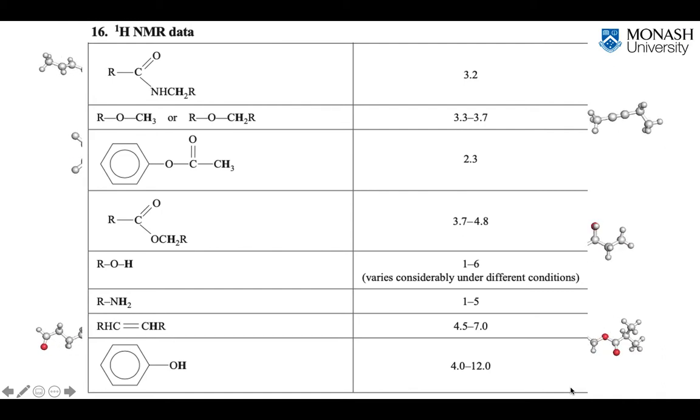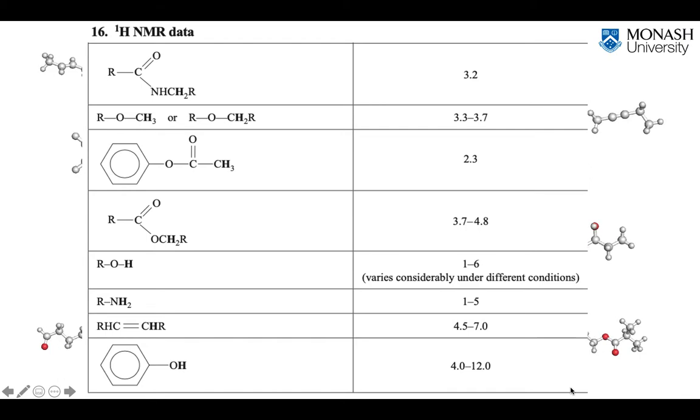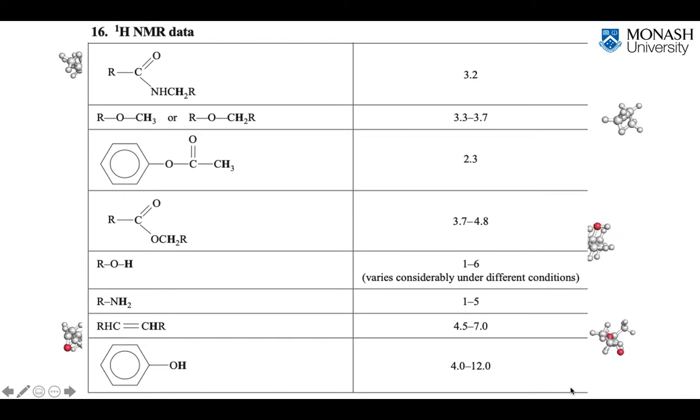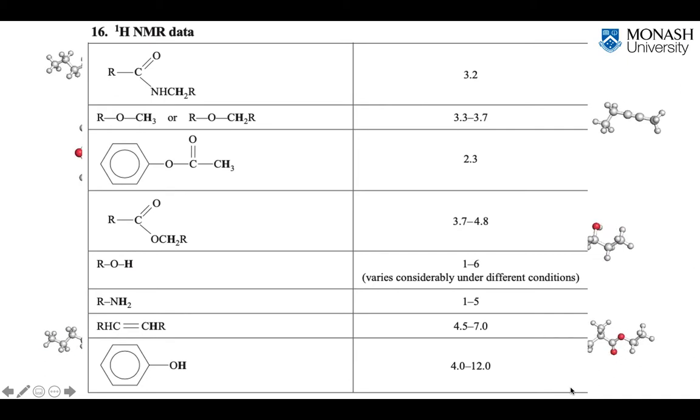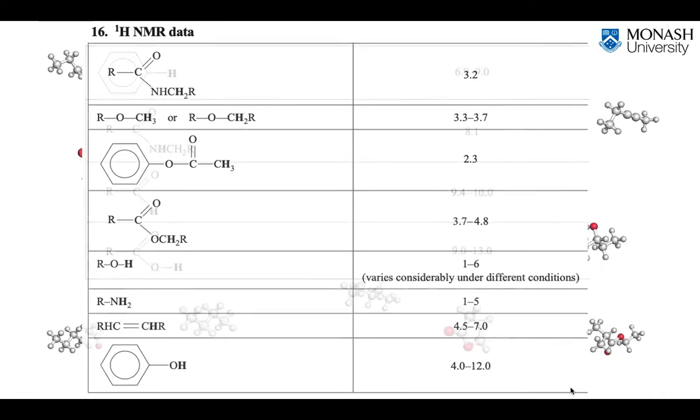Just like the OH stretch band in infrared spectroscopy, which we saw, unlike all the other bands, is really wide and really broad, similarly in NMR spectroscopy these OH and NH bands are really broad, spread out across a range of chemical shift. Sometimes they're spread out so much that they flatten and you don't even see them in the NMR spectrum. You can see alkenes are getting up towards 4.5 to 7. An OH group, which is from a benzene ring, can be anywhere from 4 to 12.